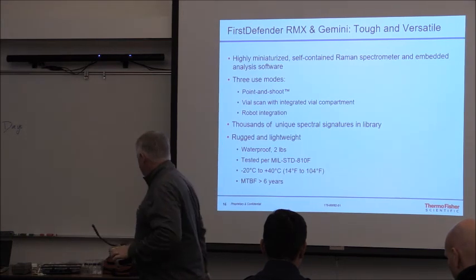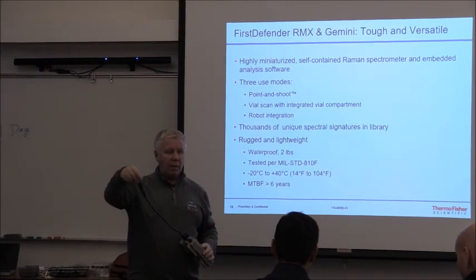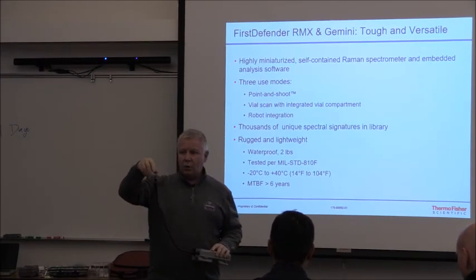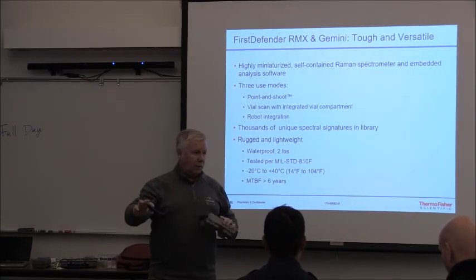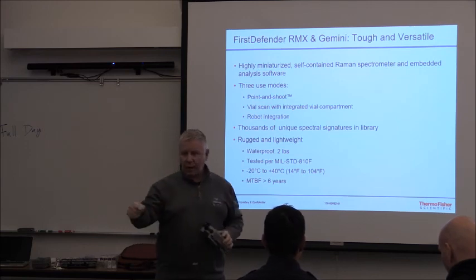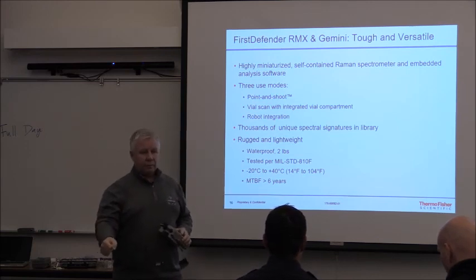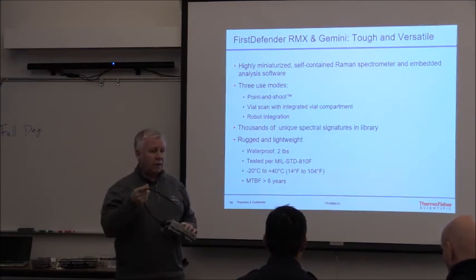Here's a little cone, and one will be in your kit that goes right on the top. Normally you want to use the cone. I'll show you that in a little bit. The reason is that when the cone is on, there's a focal point. It's like taking a magnifying glass out to burn a leaf, right? We have to adjust it to get the correct focal point. The same thing applies here.